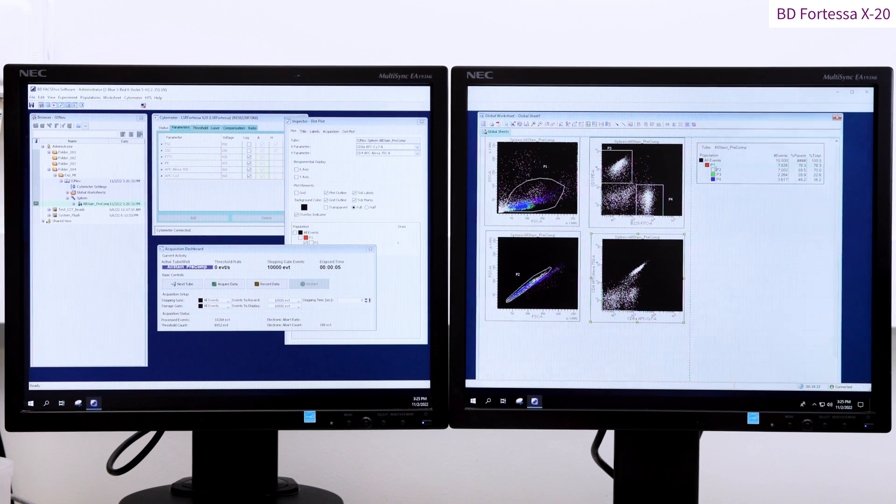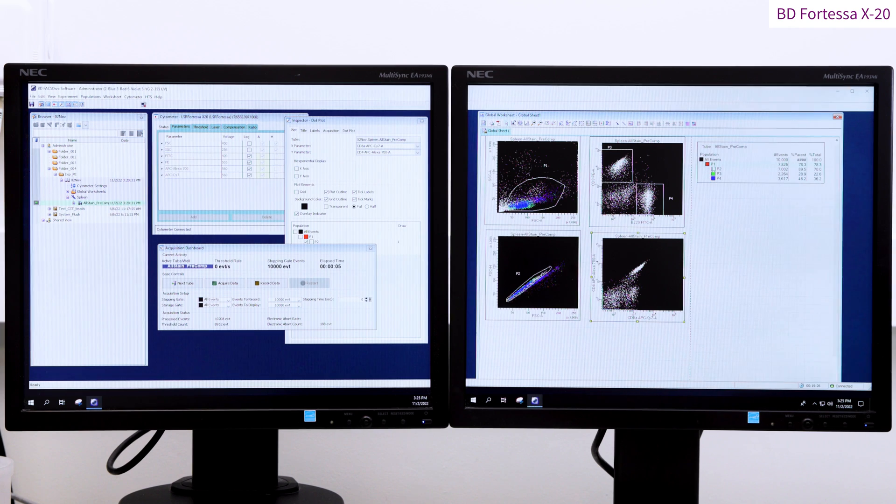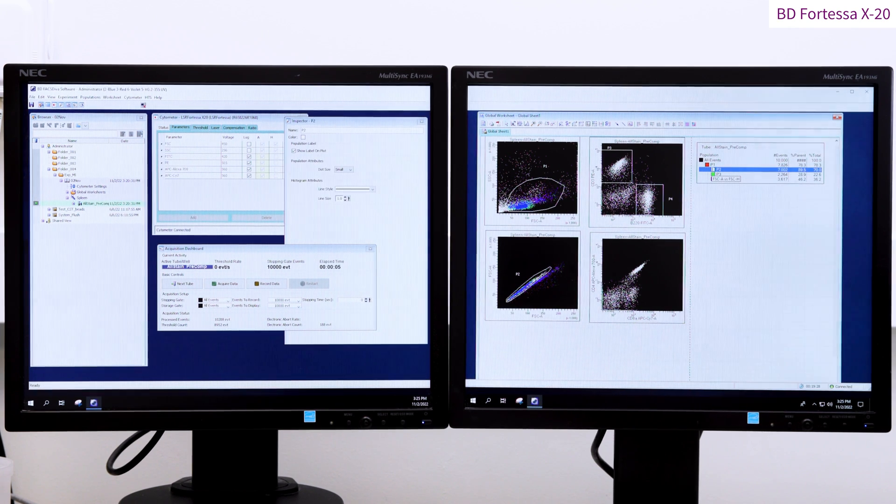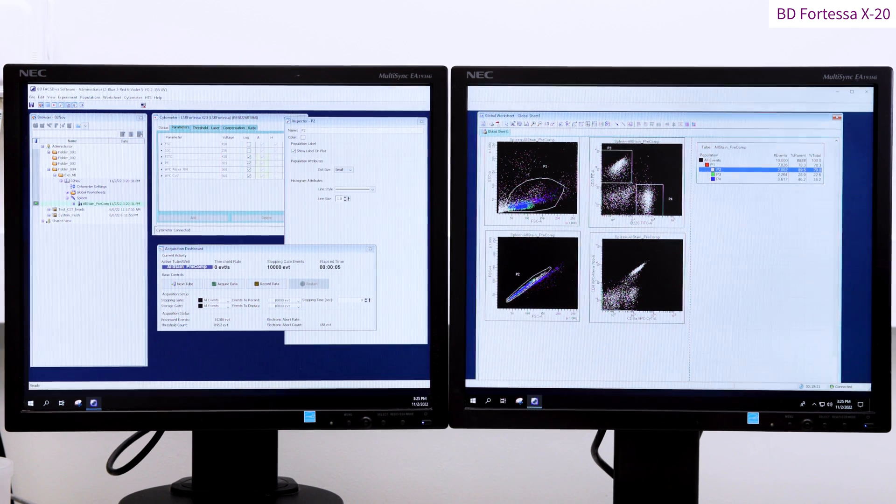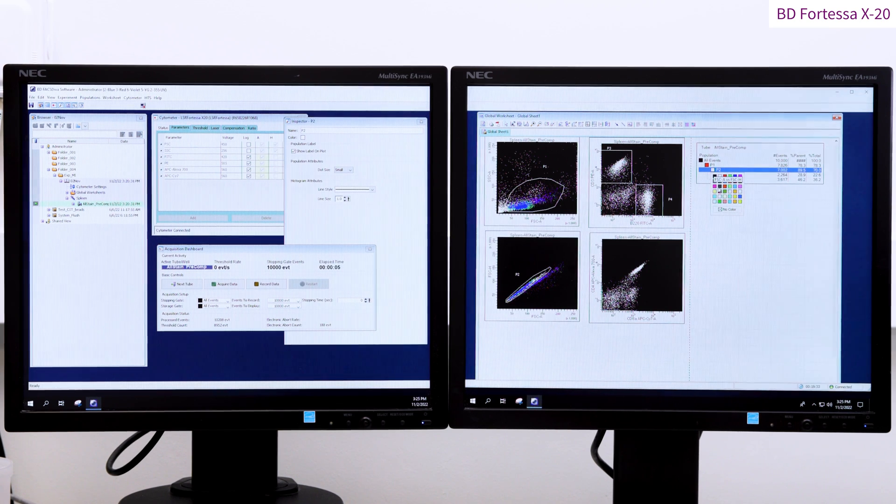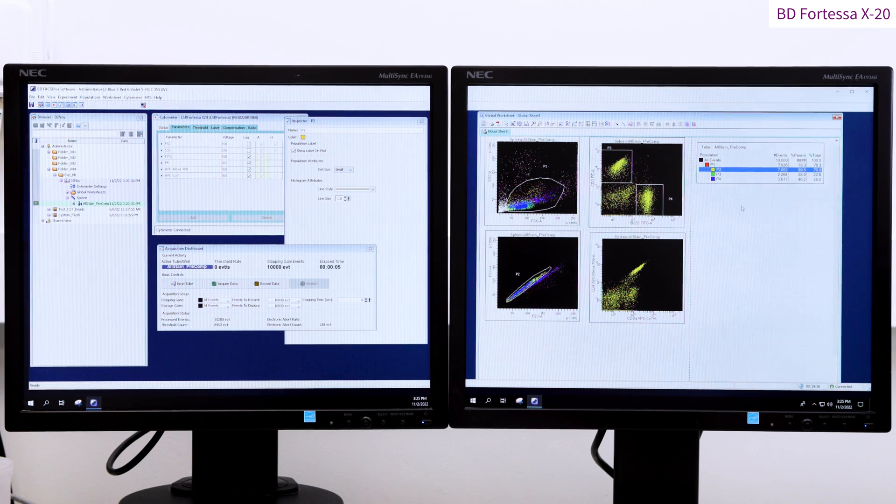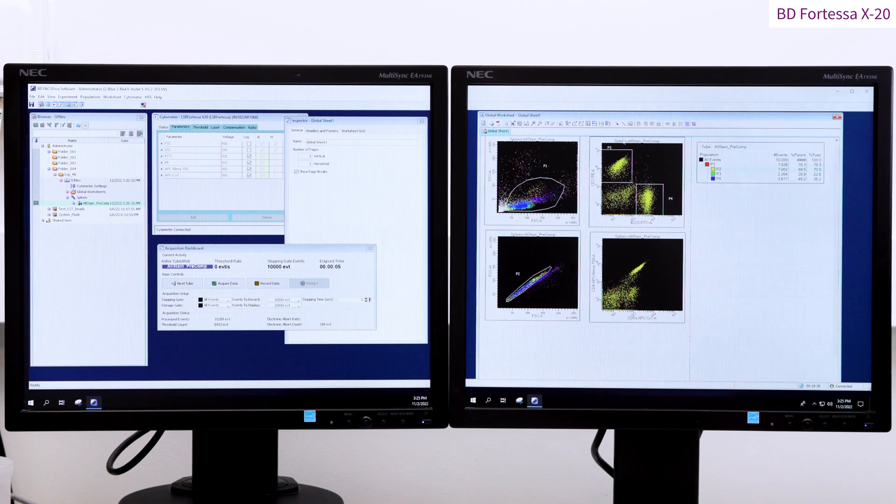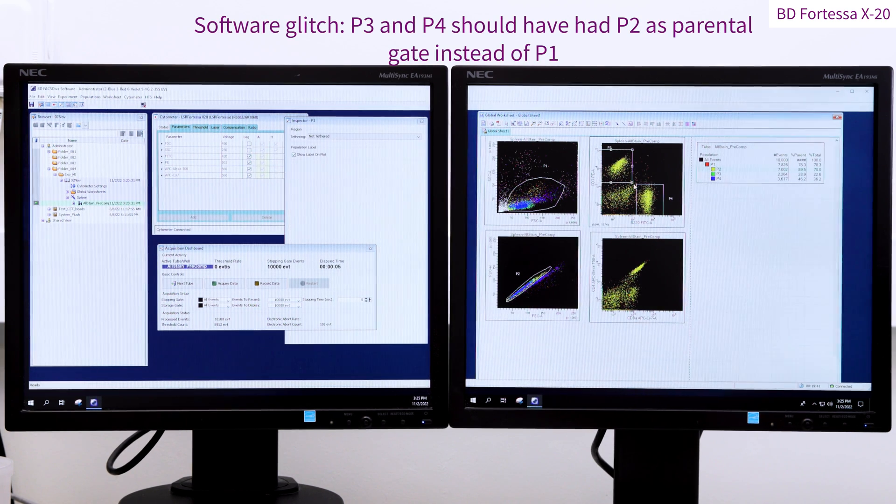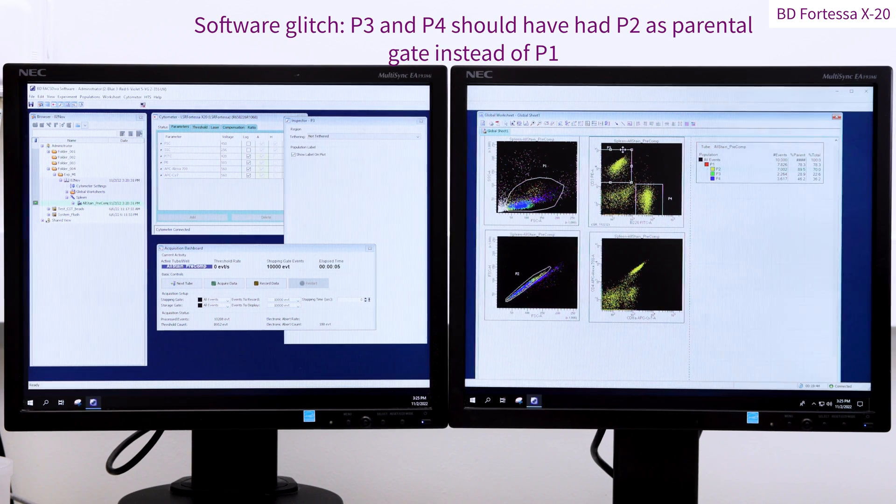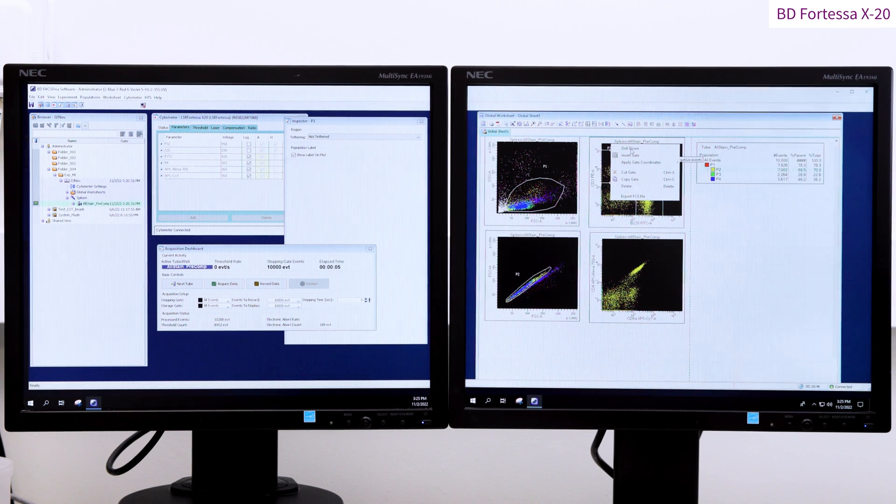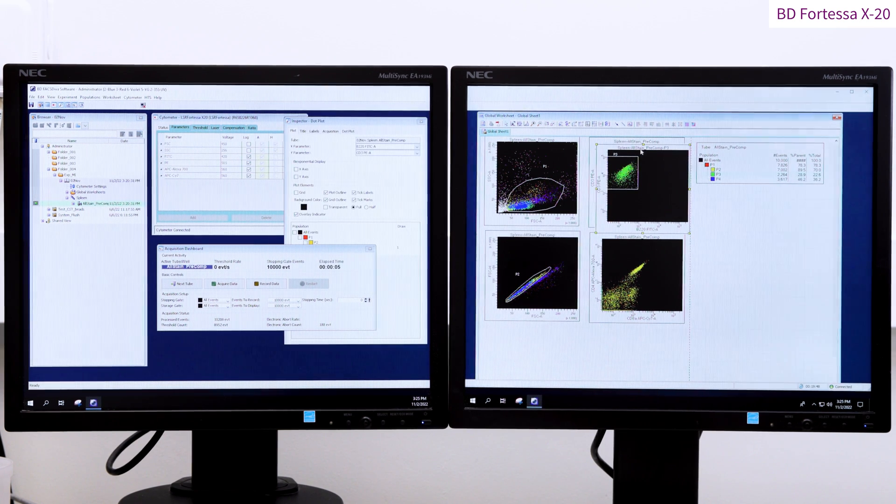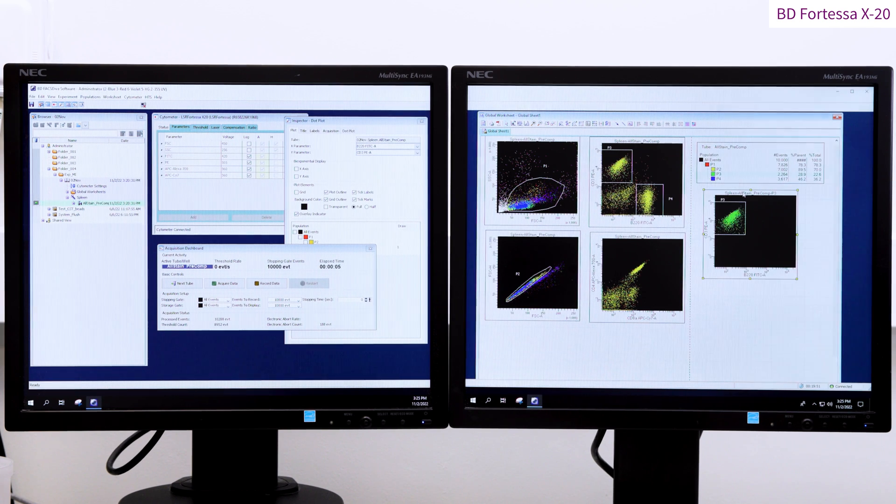We can now add further gates as required for our analysis. You can change the color allocated to a specific gated subpopulation by right clicking on the related square and selecting the color of your choice. Here, by clicking P3, you can drill down to your subpopulation analysis on CD3 positive cells, splitting those cells based on their CD4 and CD8 expression profile.